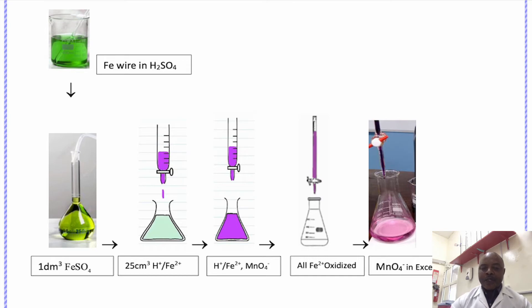The solution is already acidified. A standard solution of 0.02 mol per dm³ of potassium manganate(VII) was prepared. The titration starts. This solution needs no indicator because potassium manganate(VII) is colored — that is one of the characteristics of the deep block transition elements; all transition elements form colored compounds. On titrating with 25 cm³ of iron(II) sulfate, the color of the potassium manganate(VII) is purple.